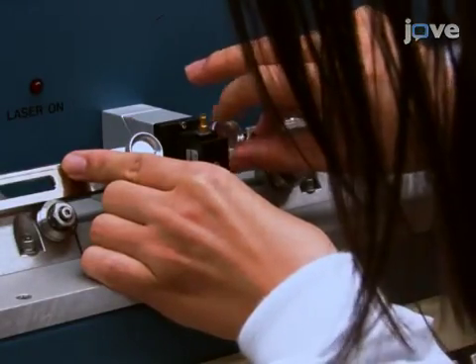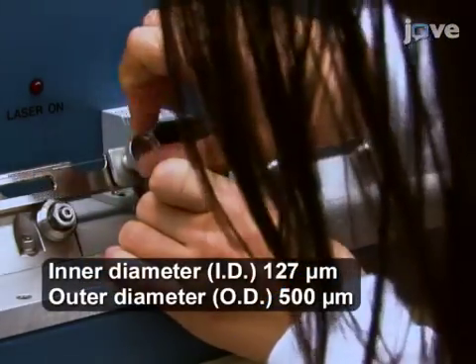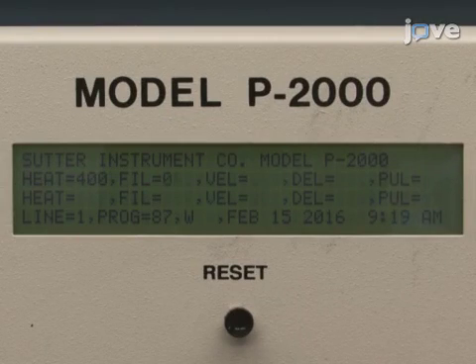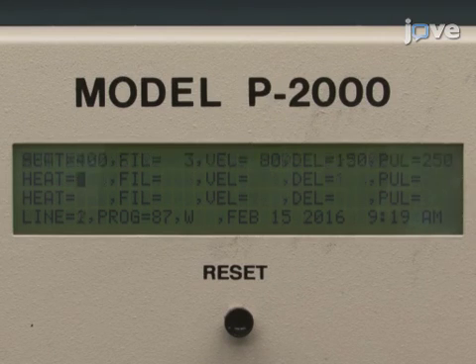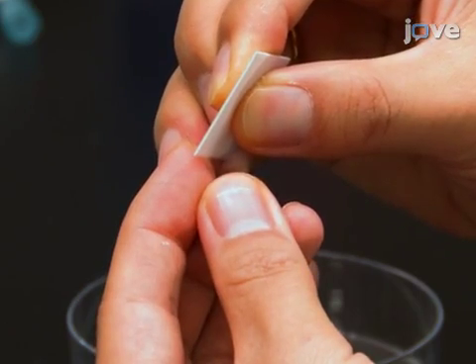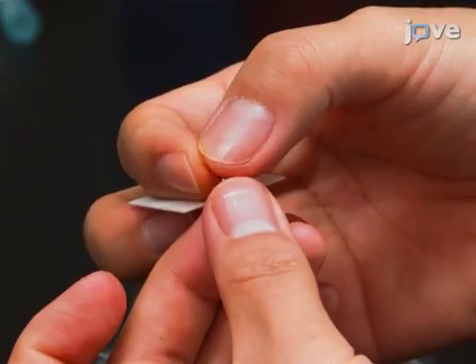Place the dual-bore quartz tubing into a laser micropipette puller and pull a dual-bore quartz needle. As starting points, set the heat to 400, the filament to 3, the velocity to 80, the delay to 150, and the pull to 250. Cut the pulled tip so that there is approximately 5 millimeters of unpulled dual-bore quartz capillary left at the other end.